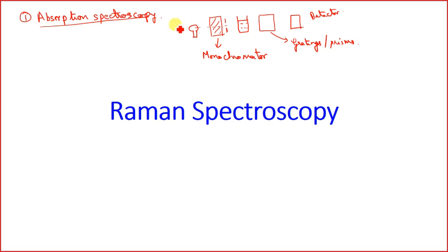However, when we put it into the monochromator, which has a slit, it decomposes the optical light, and through the exit slit only a specific wavelength of light, called monochromatic light, falls onto the sample, and then through a filter we get to the detector.